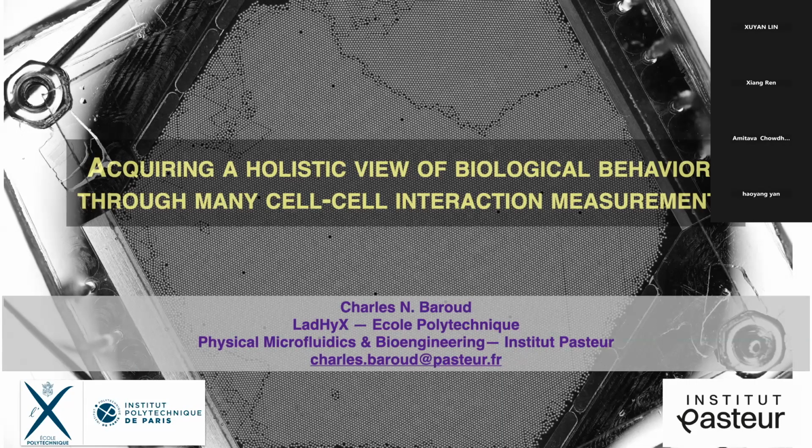I'm sorry about this kind of ugly title. What I usually call this presentation is War and Peace in a Microfluidic Droplet, but I thought maybe that's not very easy to understand. So what I will talk to you about today is how we can actually learn something about biology by leveraging things that you can only do with microfluidics, basically.